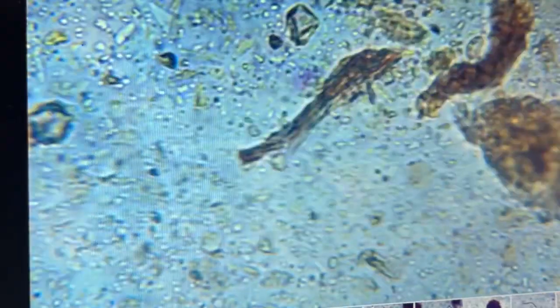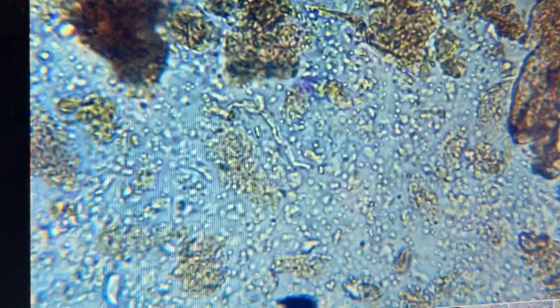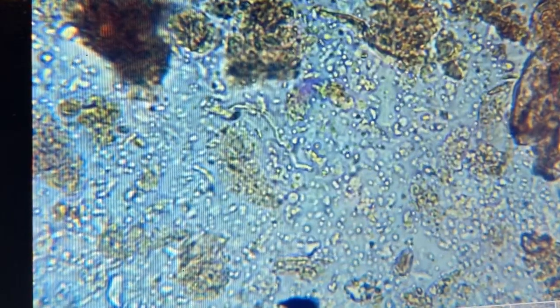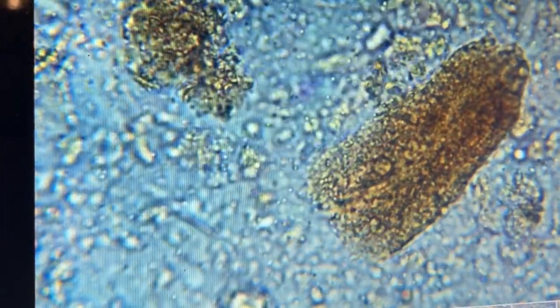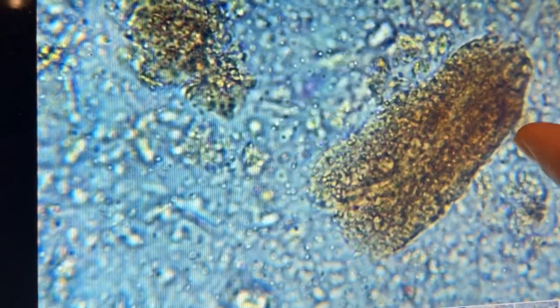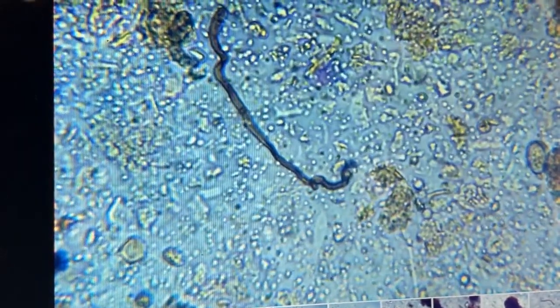It's got a ways to go decomposition-wise. Zach thinks if you incorporated a culture with more fungi and more protozoa, they could reduce the bacterial populations, which in turn would help break this down faster, gluing it together. He points out active fungal hypha — a nice chunk right there. This raw material is what he feels is holding back no-till aspirations, because we've got a soil full of material that can't turn into the humus-type thing we need. There's a thread of fungal hypha right there — beneficial, it's good.